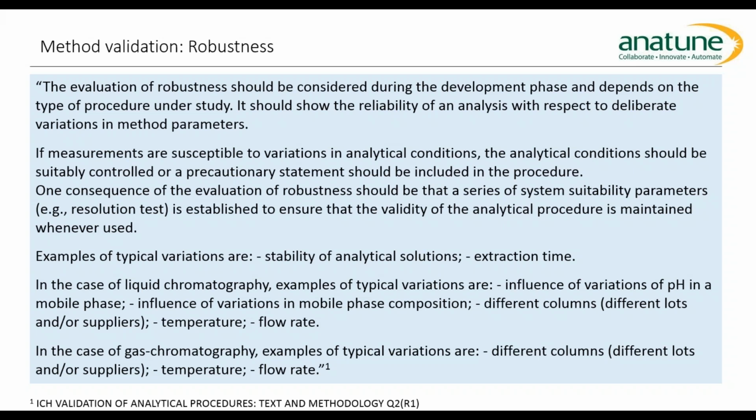If a heated zone on your system is slightly different compared to where it was before, is your methodology going to fall apart? If your column is a different length slightly, for example, in the GCMS method, is it going to make a difference to the analysis? And so, it's quite easy to see how we could vary things in gas chromatography. For example, we change the column, change the temperature program, change the flow rate. Same applies with liquid chromatography.